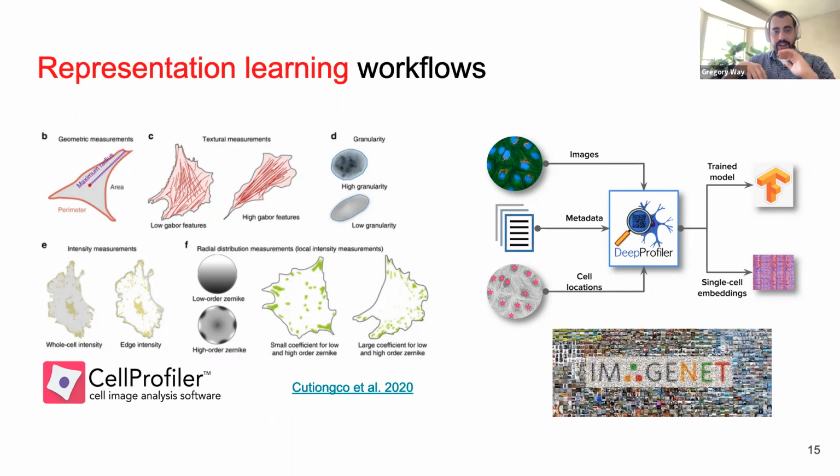Like the areas and stuff, those are definitely going to be different, but that's at least for Cell Profiler. Now, for Deep Profiler, we don't have as much evidence to suggest that different cell types are going to have similar features for the same deep learning model. I suspect that they will in many cases. I think it's going to be pretty similar to Cell Profiler.